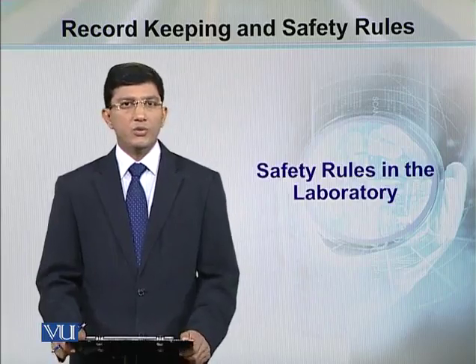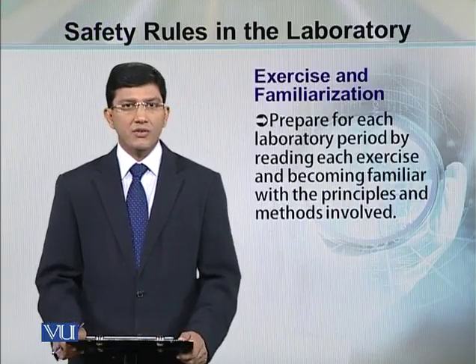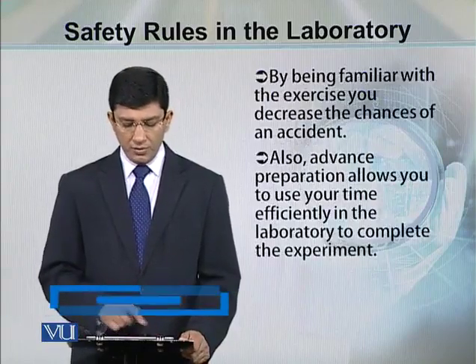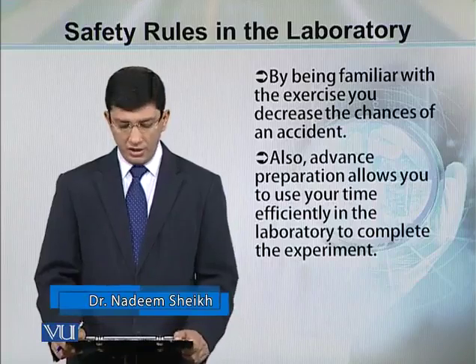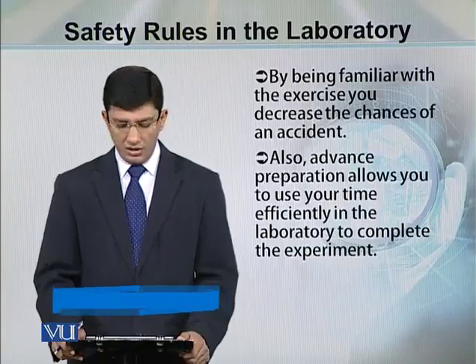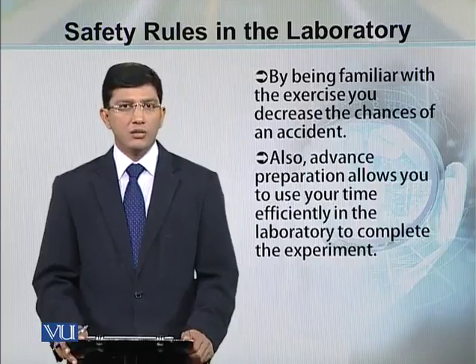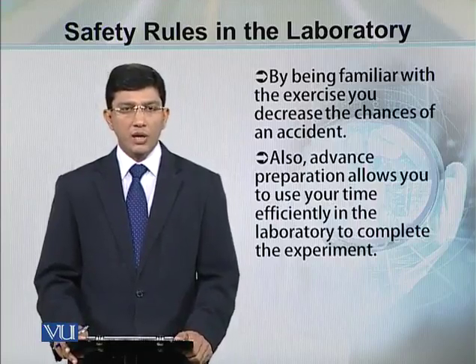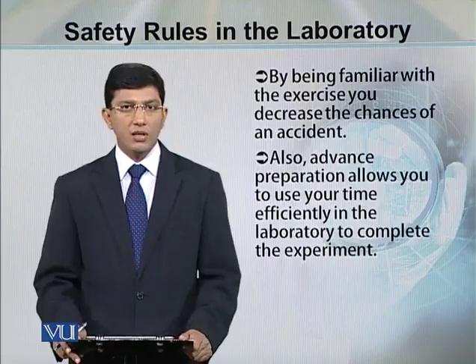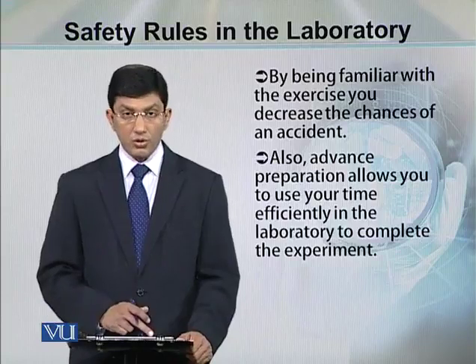Therefore, any student who has to work in a laboratory should be familiarized and should do some exercise in order to avoid such kind of accidents. Being familiarized with the laboratory, there is reduced chances of accident, and if you have done any advanced preparation that helps you in maintaining your time and experiment quite well in time in the laboratory, you can efficiently use your time in the laboratory and complete your experiment or research work within due course of time.